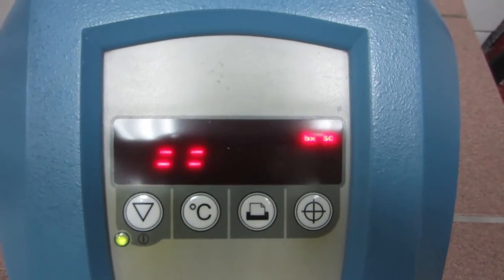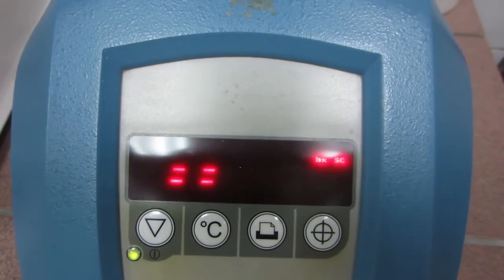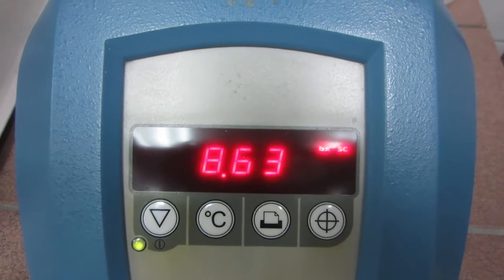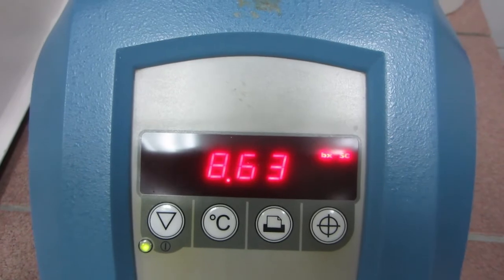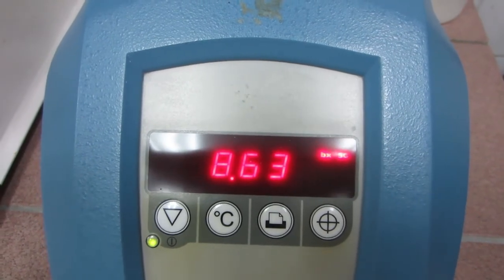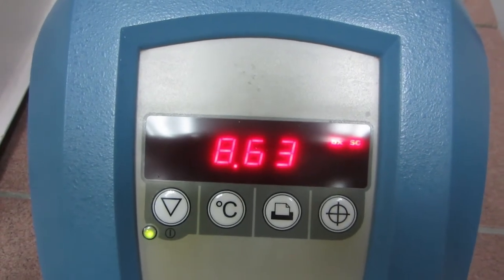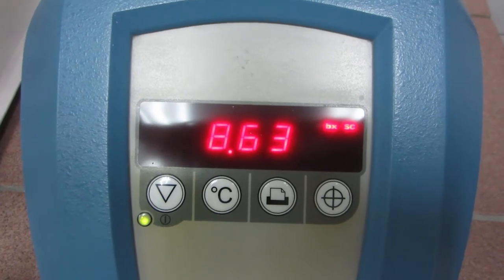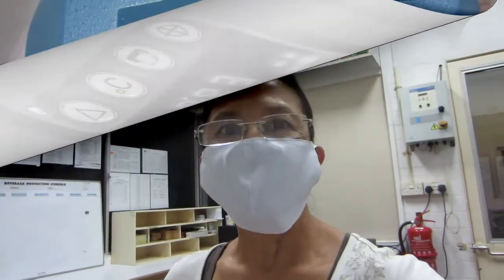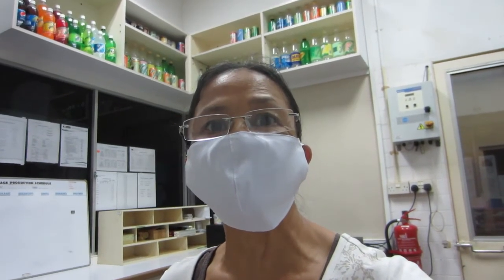Let's try pressing it a first, second, and third time. Three consecutive readings — the figure comes out to be consistent. The sweetness is 8.63; that is the Brix reading of this liquid solution.